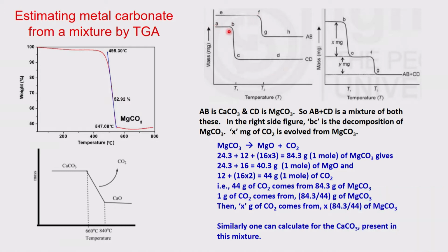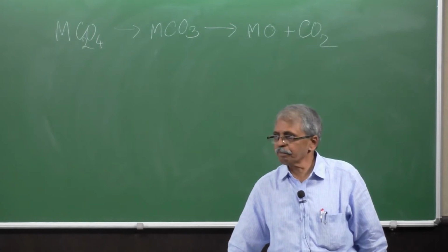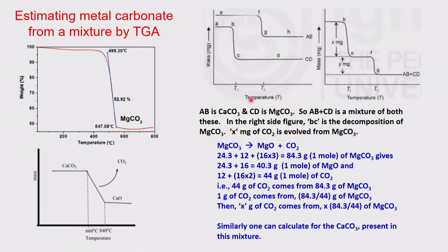So, individual thermograms you can see here, other thermogram. But now, if I take a mixture of these two carbonates, namely the magnesium carbonate and the calcium carbonate mixture, still I can see one of them and the other, because their breakdown temperature differences are something like 200 to 250 degrees. So, it's around 750, this is around 500. So, there is a 200 plus difference very nicely. So, you can see this is a mixture. So, you can get one, you can get two.